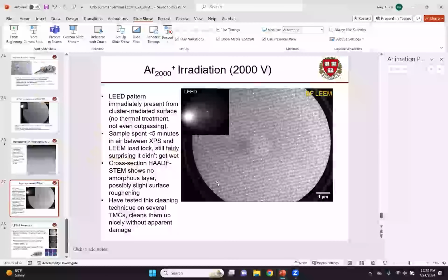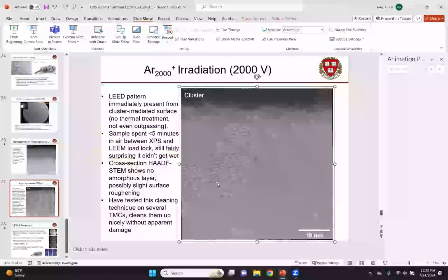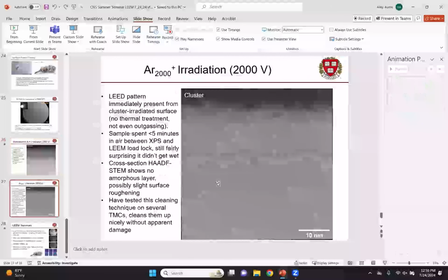On the other hand, if you make with the cluster irradiation, toss it right in the LEEM, you don't even do the outgassing to get rid of water, which is kind of surprising. Instant LEED pattern, crystal structures preserved, and if you look at it in cross-section TEM, it's a nice, beautiful crystal right up to the surface there in vacuum. Surface is a tiny bit rougher, which is kind of interesting.